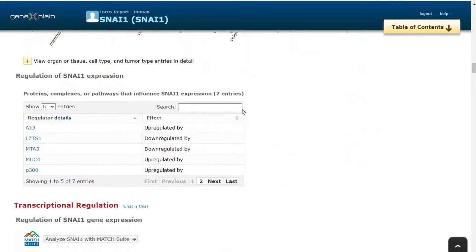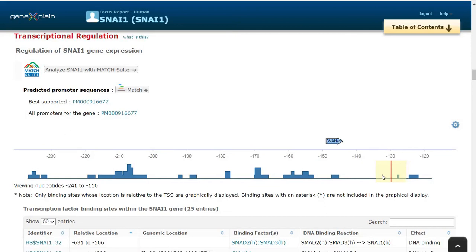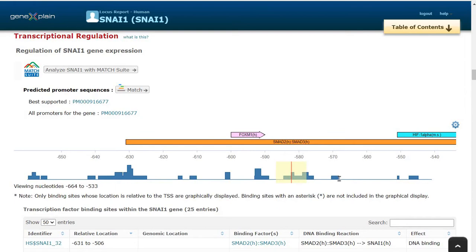The next section is transcriptional regulation of SNAI1. The blue boxes are several transcription factors binding to the SNAI1 promoter. The details of the factors in the yellow box is shown in the upper line. When we drag the yellow box, we can see that SNAI1 factor is also binding to the promoter, creating a very short feedback loop. We can shift the frame and see several transcription factors like EGR1 and several other factors binding to the promoter.